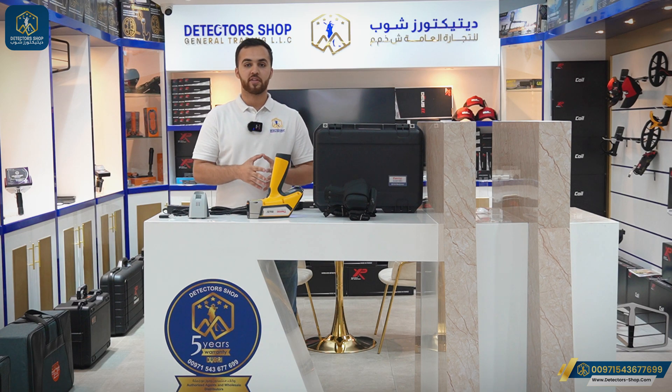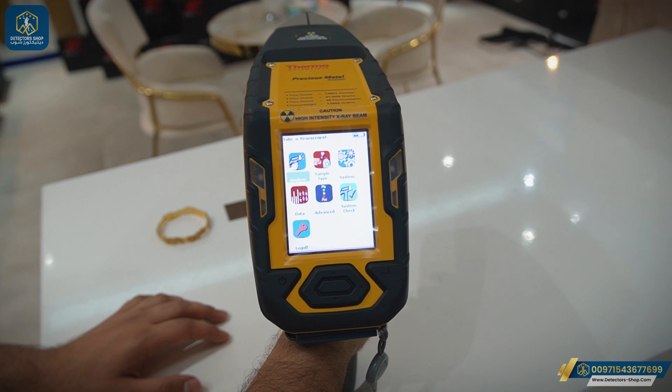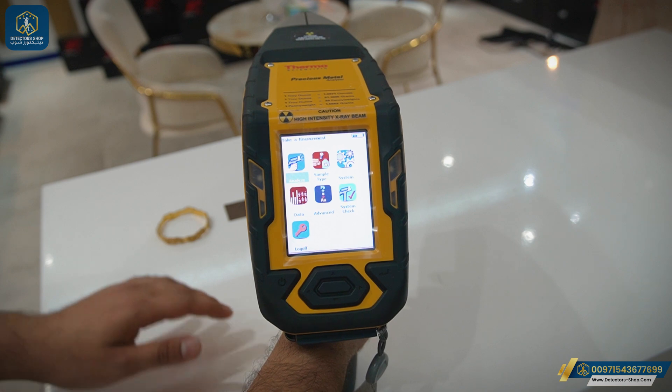Now we'll run an experiment to see together the difference in the analysis for each type of metal. We'll see an experiment on a piece of gold, a piece of manufactured gold, and also a piece of copper. Here we are in the main menu after turning on the device, and we'll go now to the analyze mode.